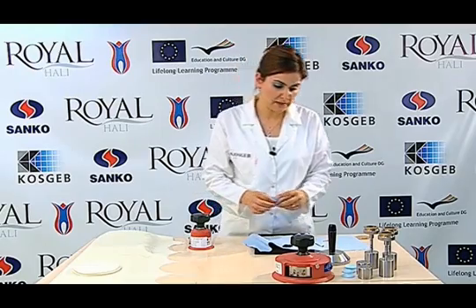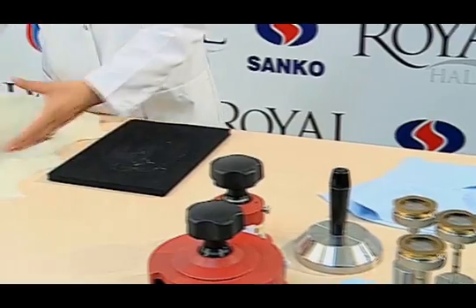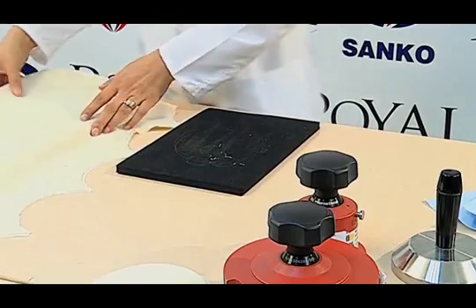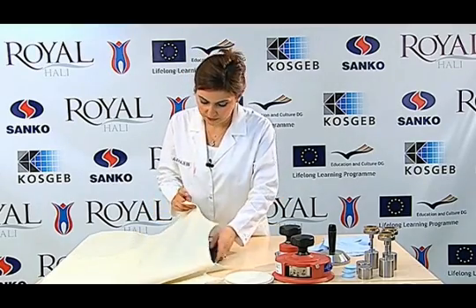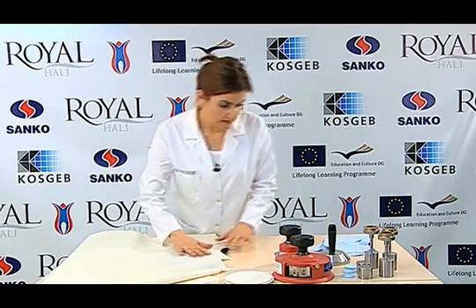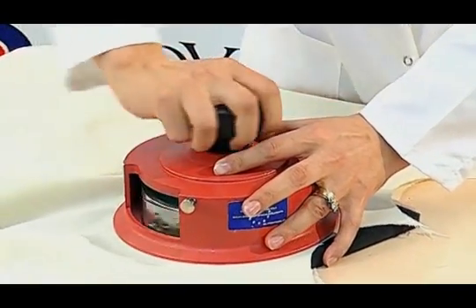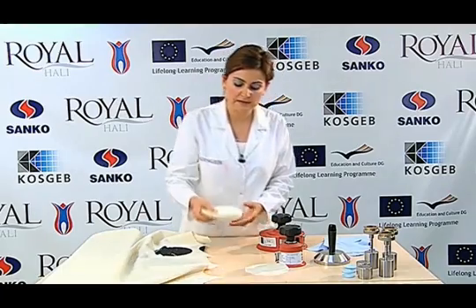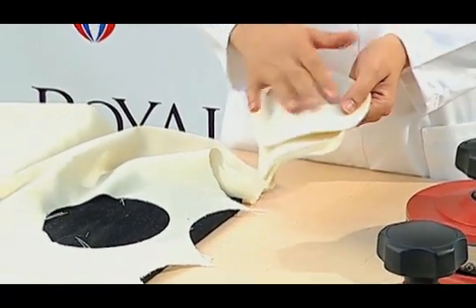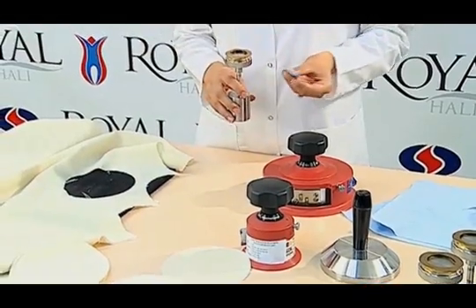A 100% standard wool sample is cut as abrasive fabric for 38 mm wide samples. We place the fabric on the table. A 140 mm felt is placed before the fabric we cut on the table.